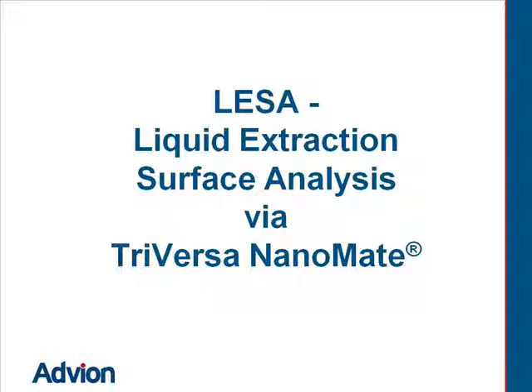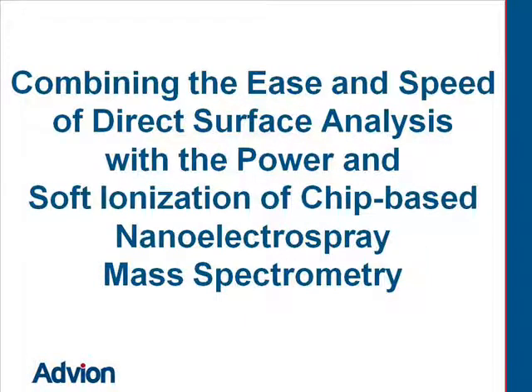Liquid Extraction Surface Analysis via Advion's TriVersa NanoMate — combining the ease and speed of direct surface analysis with the power and soft ionization of chip-based nano electrospray mass spectrometry.